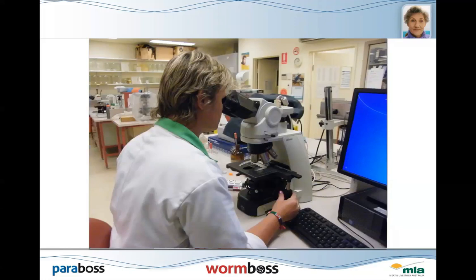Okay, so that's how a larval culture is done, and I think it's just handy that you have some idea what's involved and that there is some complexity to it, and that's why it's pretty good to send it to a lab.